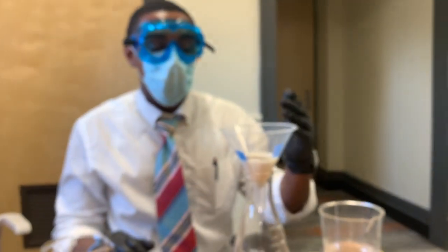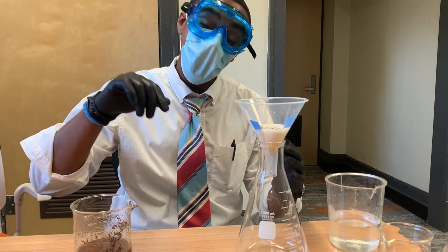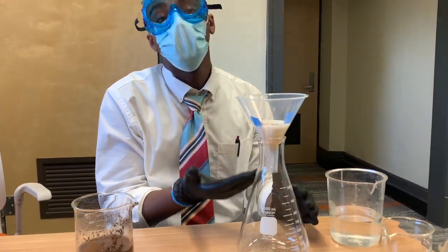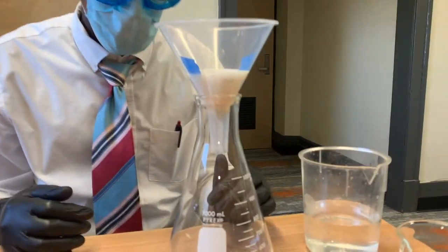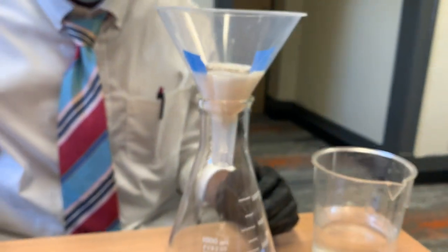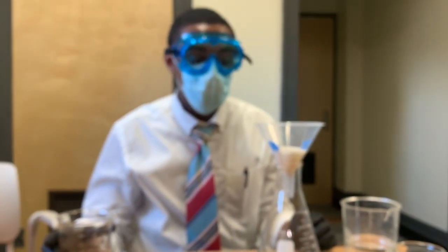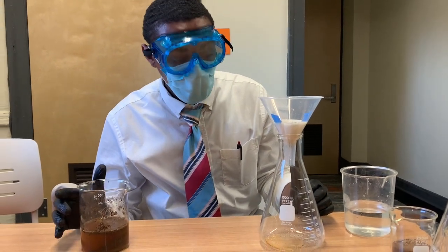It's kind of like having coffee grains, right? When you make coffee, you pour the hot water on the coffee and the coffee filters out through the filter. But this is not drinkable. We cannot drink this. It's gonna take a long time, but we have a lot of patience.